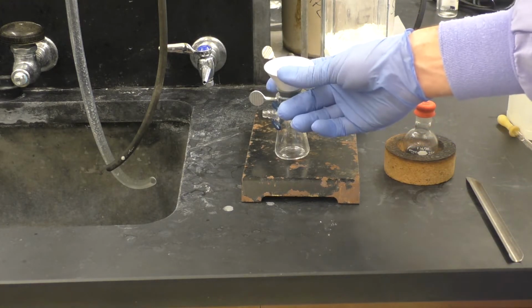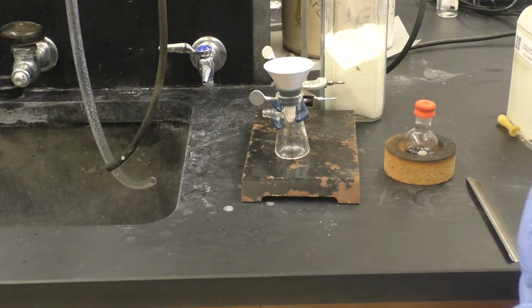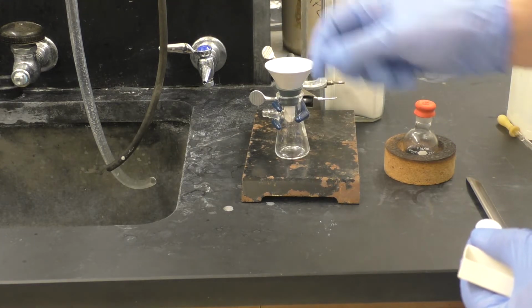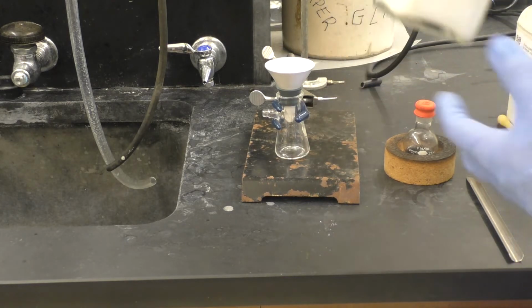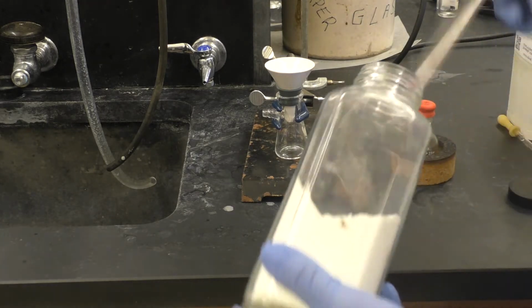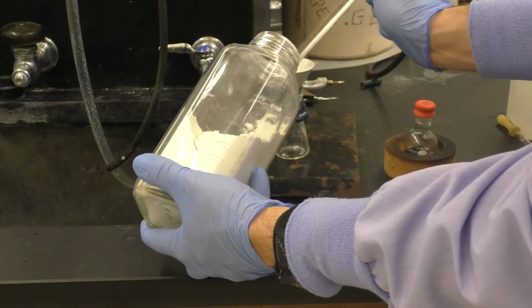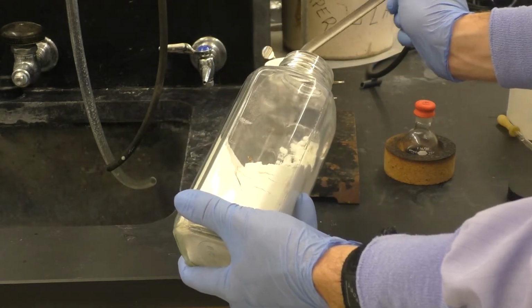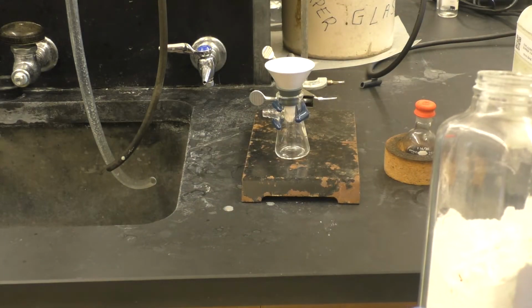So here I have the Hirsch funnel. Right here, I'm going to take a small filter paper and add that onto the Hirsch funnel. So a small piece of filter paper there that will keep the Celite in place. I can then take the Celite here and add a scoopful or two directly onto the Hirsch funnel. I'll do quite a bit here just to make really sure that everything gets caught.